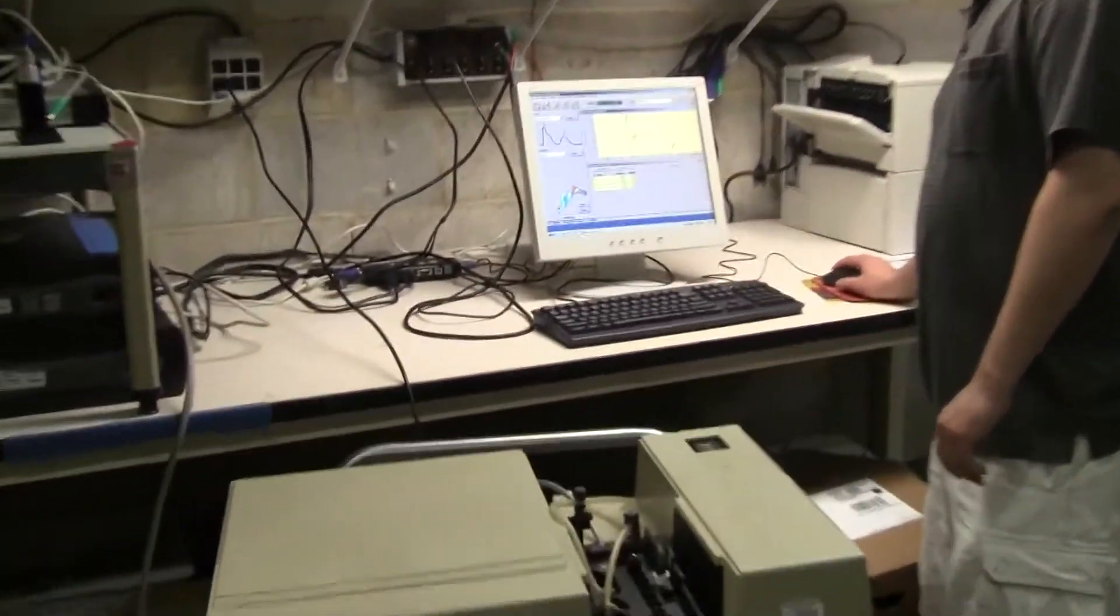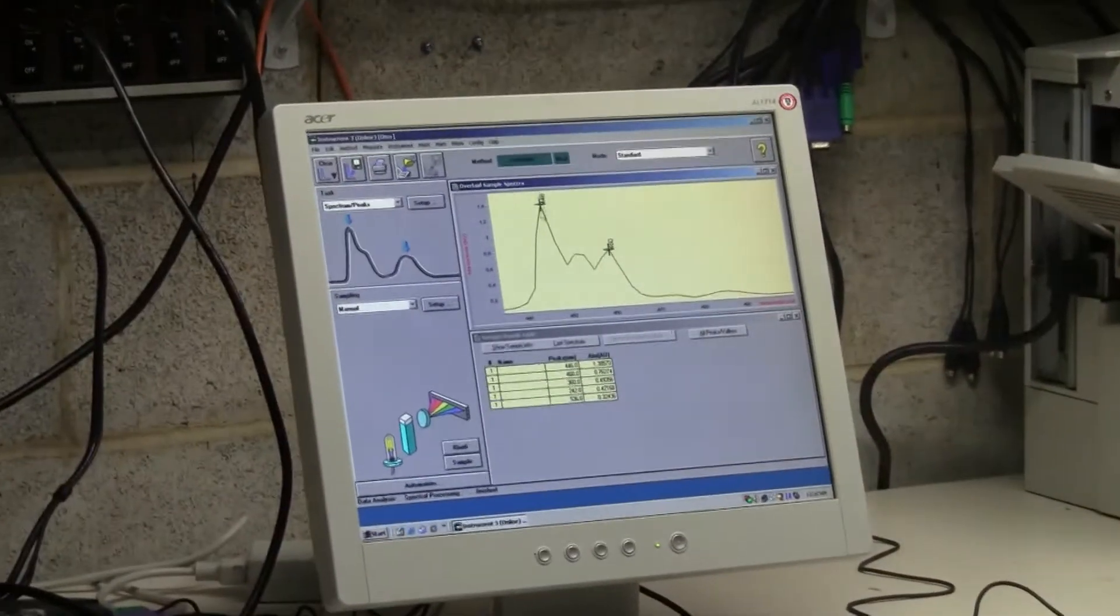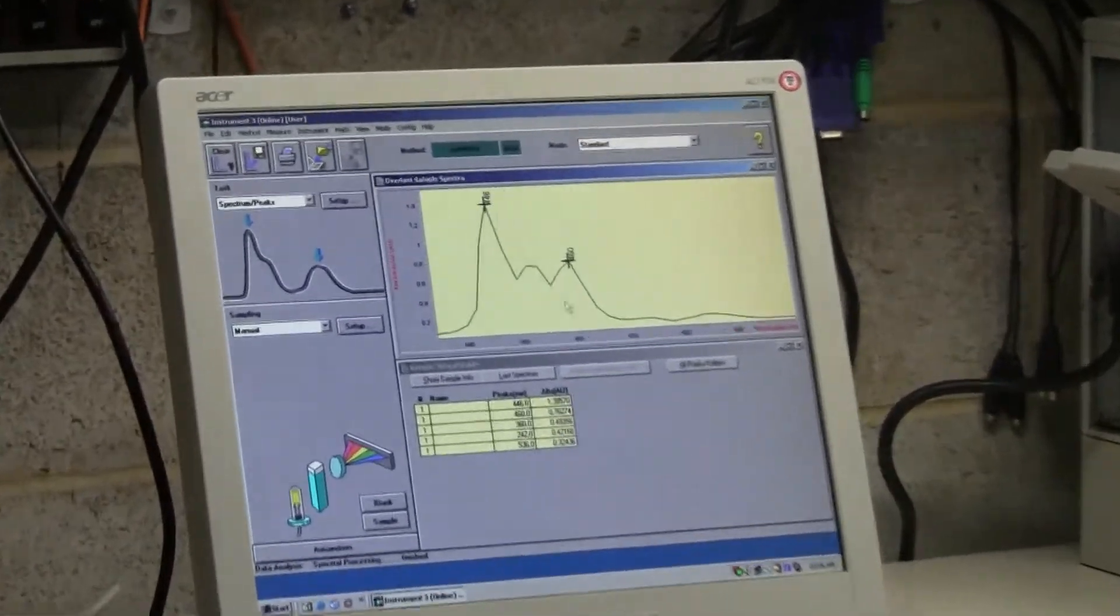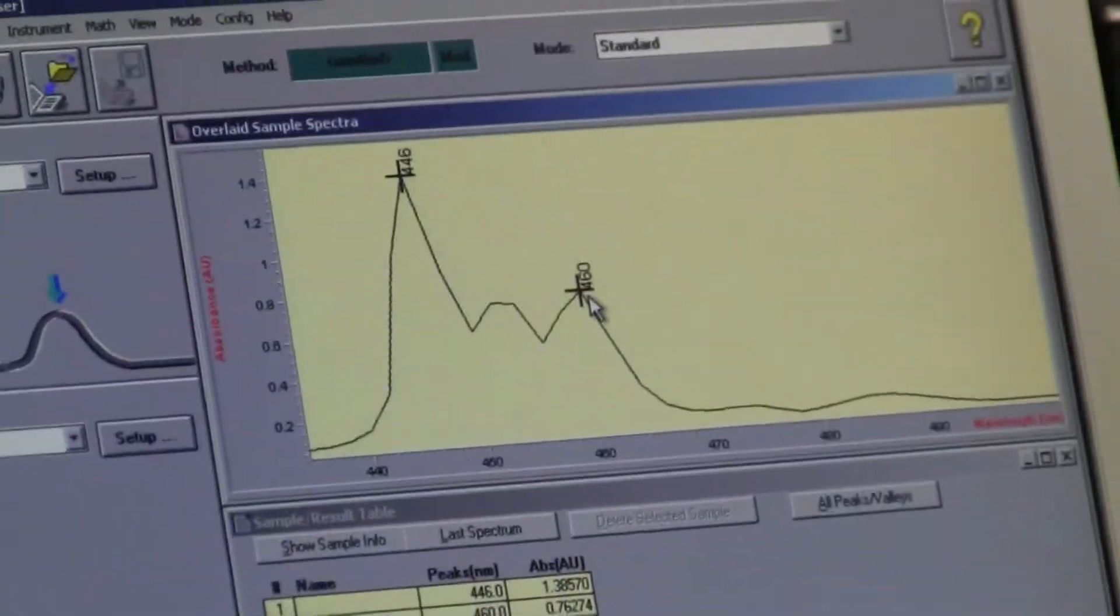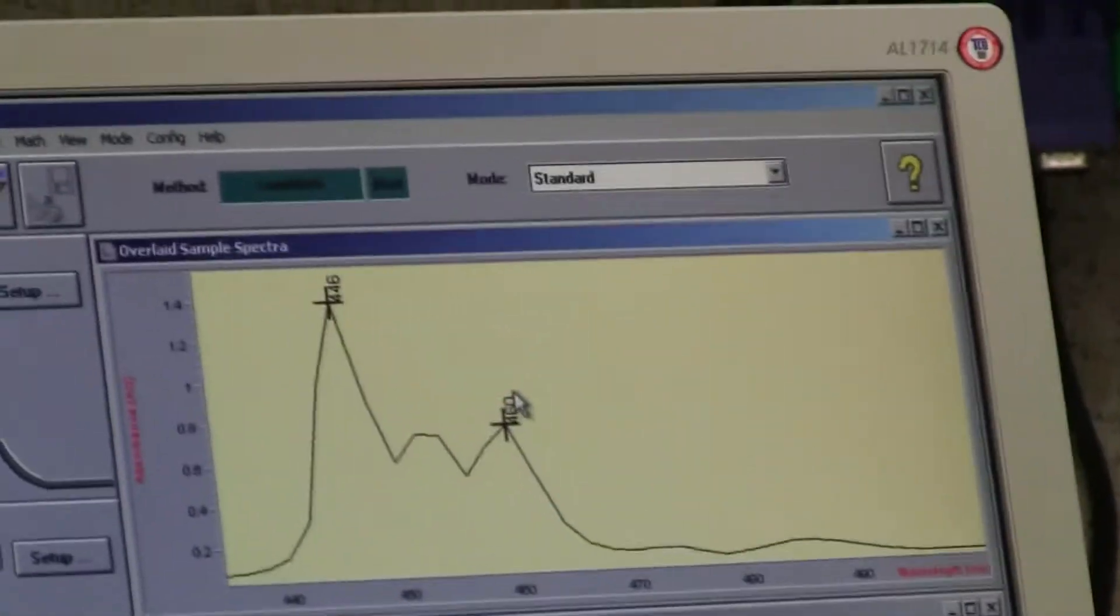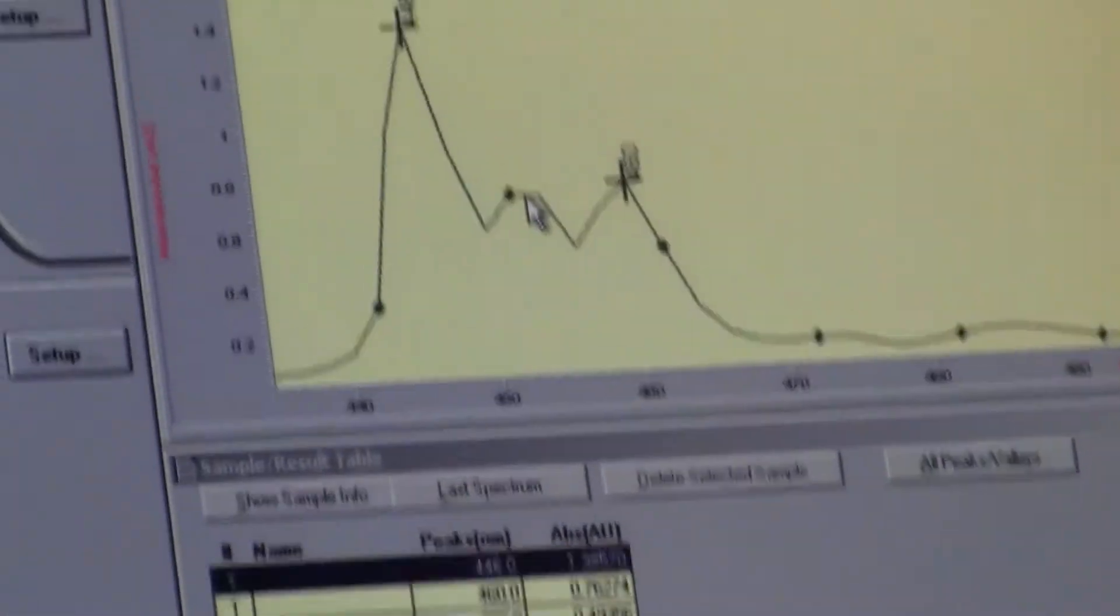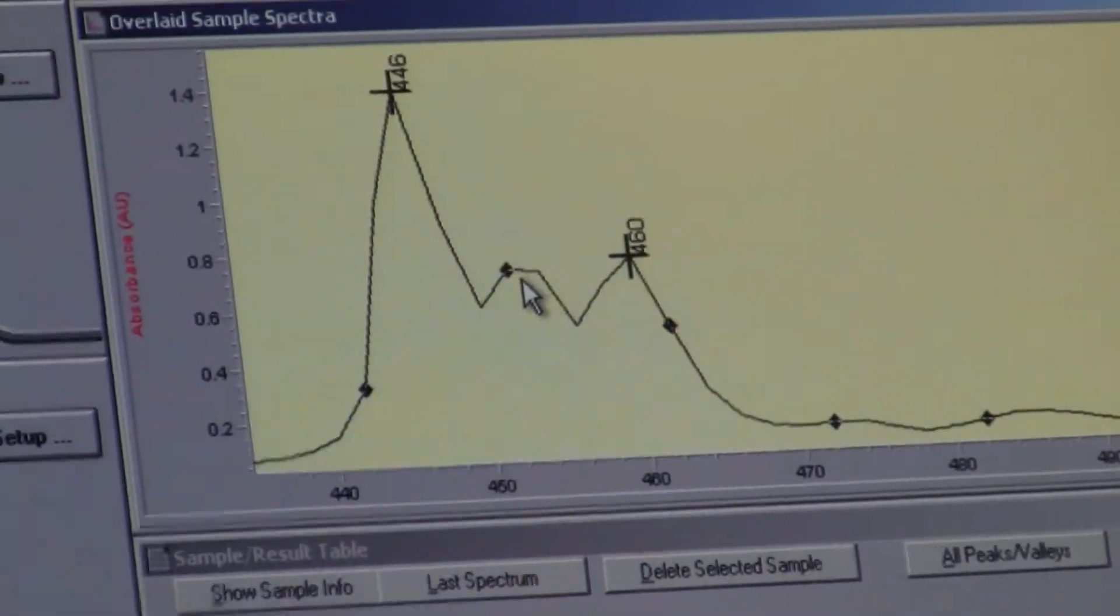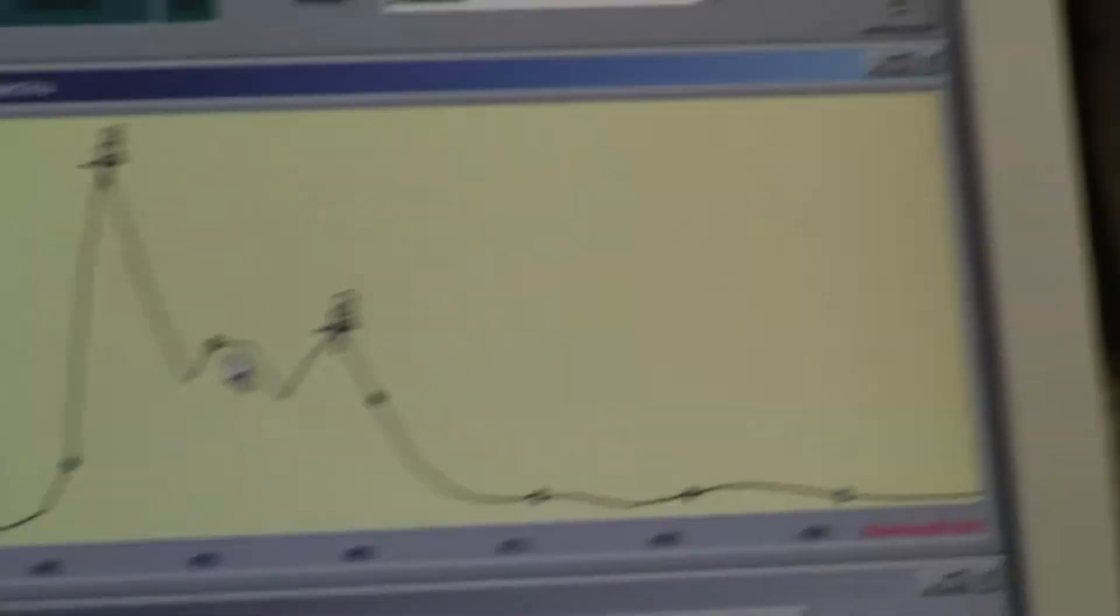Looking to the 446, 460. If you have any further questions, please don't hesitate to call 609-518-9100. Thank you from Hi-TechTrader.com.